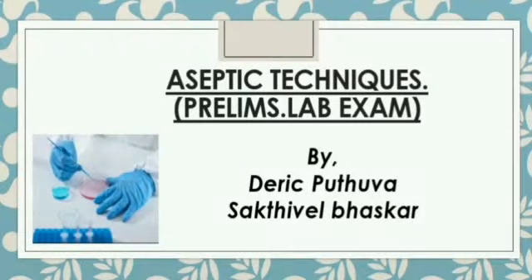Hello, sir. Today we are going to discuss a few procedures which are necessary to follow, which is the general aseptic technique in microbiology. Myself, Derek Pudua from section 12A, will be explaining this procedure, and Master Shaktivel Bhaskar, my B.Com member, will be demonstrating the technique and the procedure.